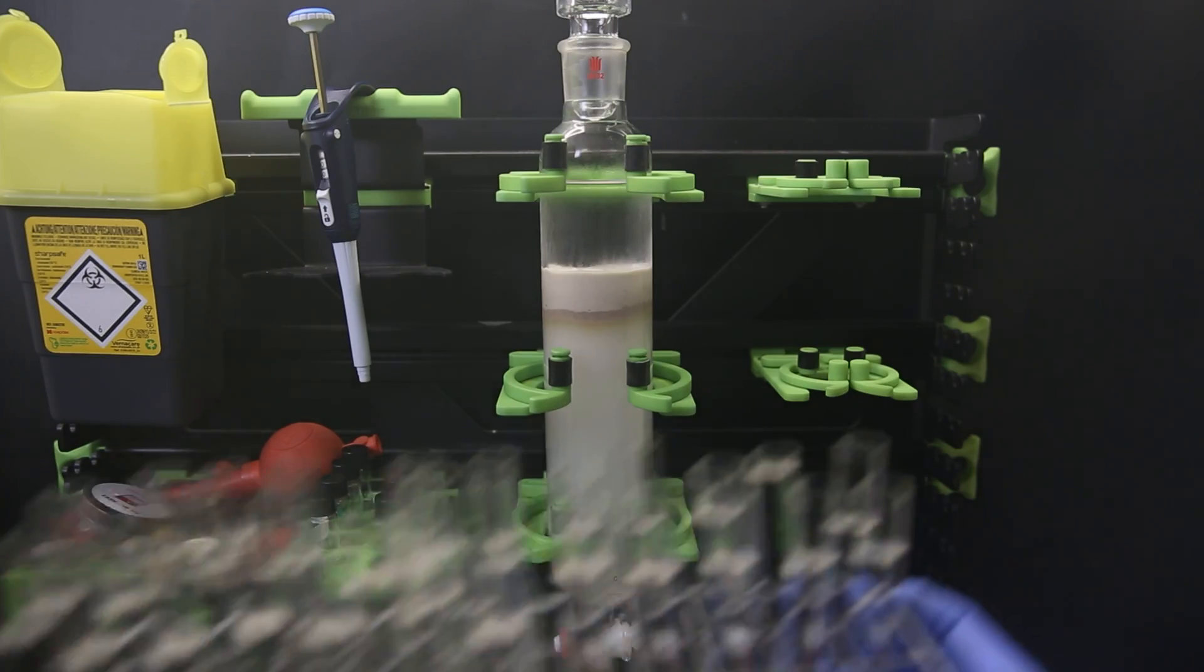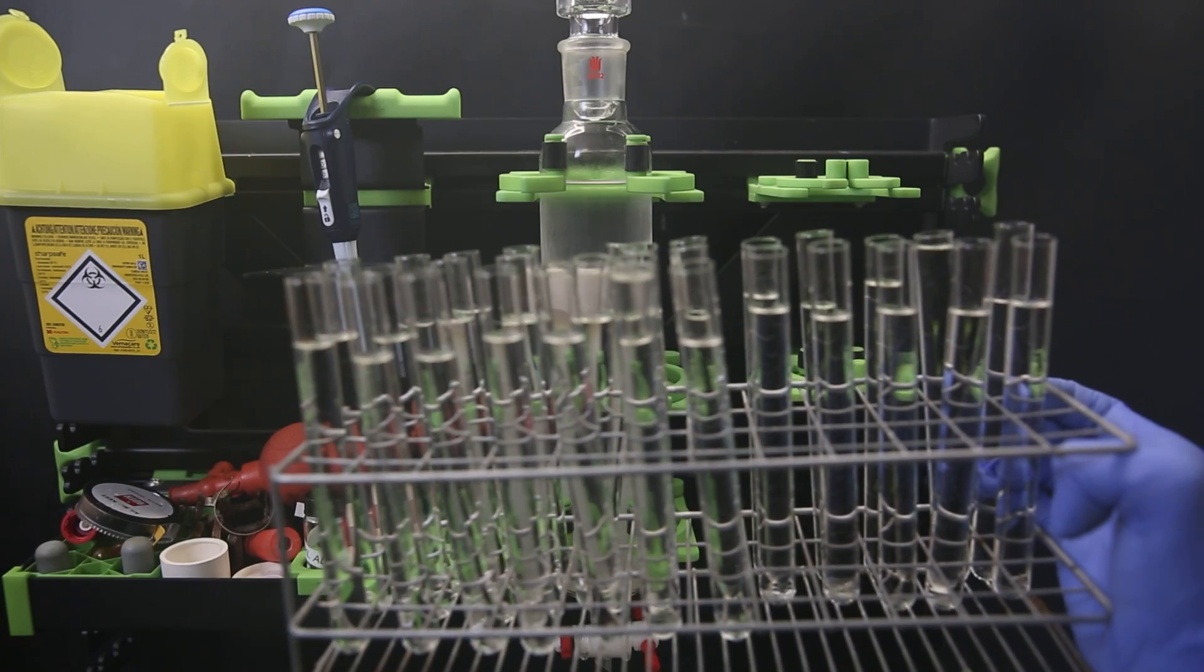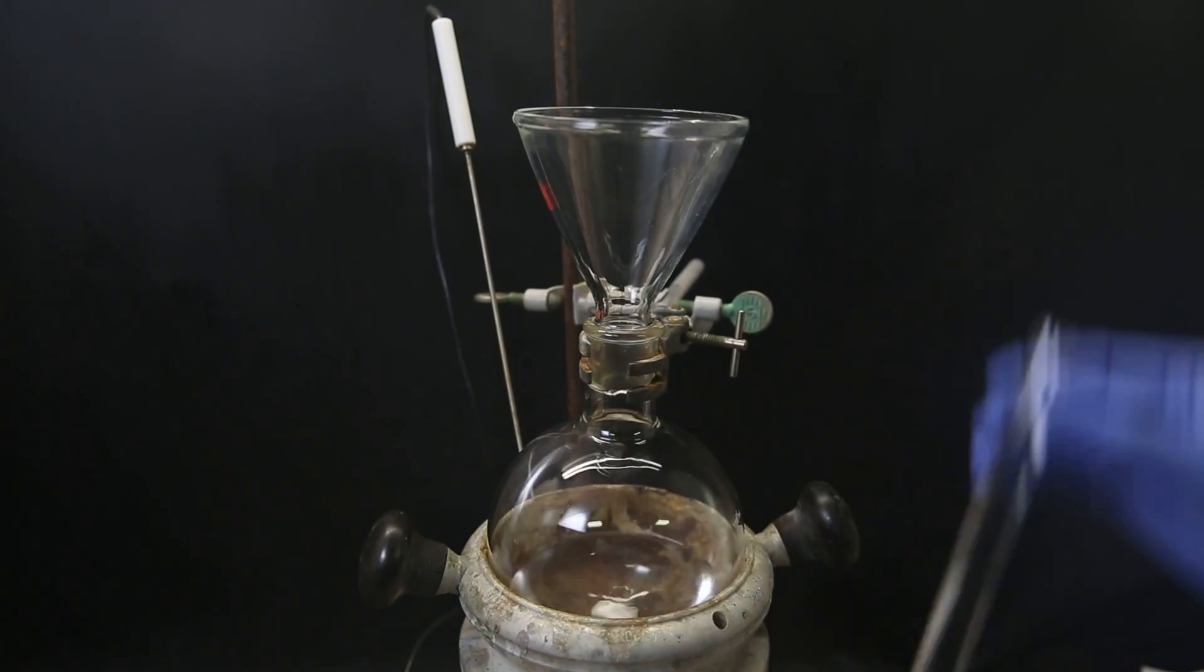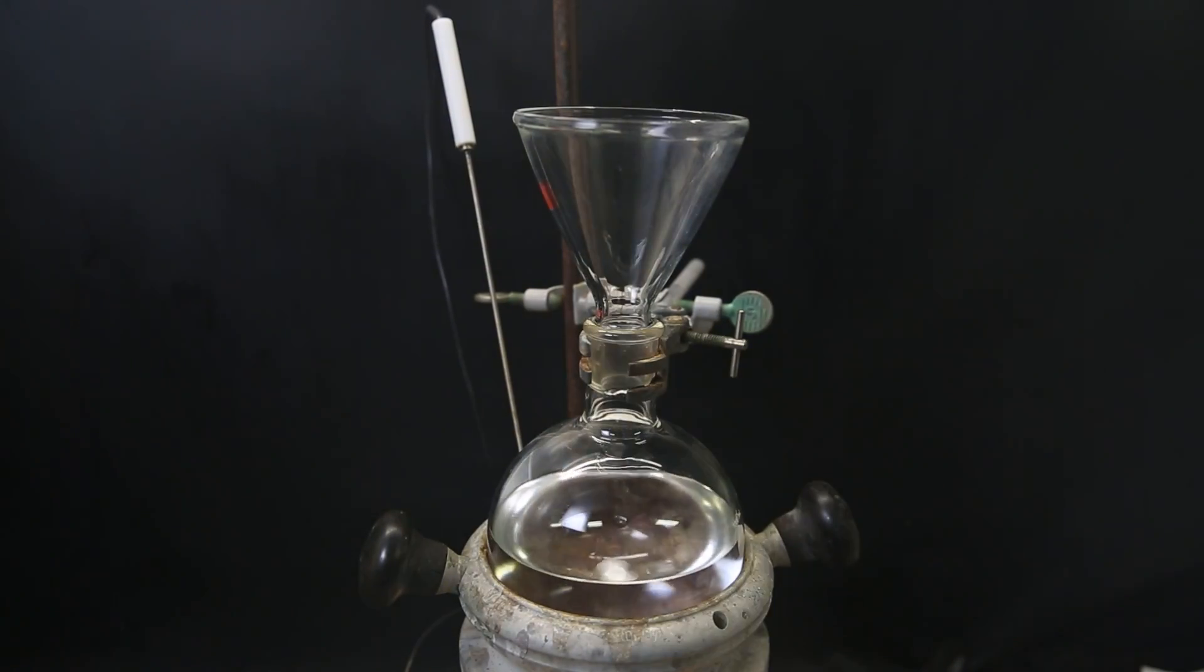In the end, I collected about 30 small fractions and one big fraction at the start. Analyzing it with TLC, we see that the big fraction 0 contains only impurity, and fraction 1 still contains some of it as well. I discard both of those and take fraction 2 and all that came after. I combine all of those in a large flask and distill off all of the solvent.